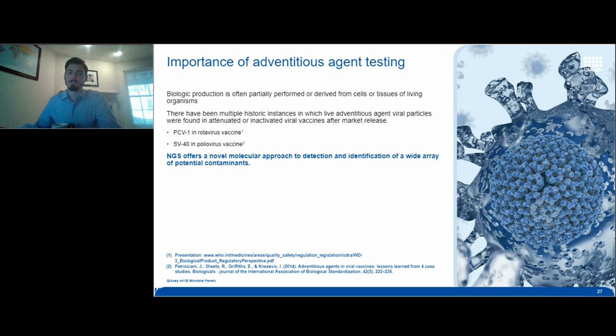But the point is that you could easily accidentally end up with these viruses in your bioreactor batch. And it's not something that you want to risk putting into patients because we don't necessarily fully know the effects. So there is interest in having bulk level testing of batches before they're filled into vials to make sure that they don't contain these viruses and things like that.